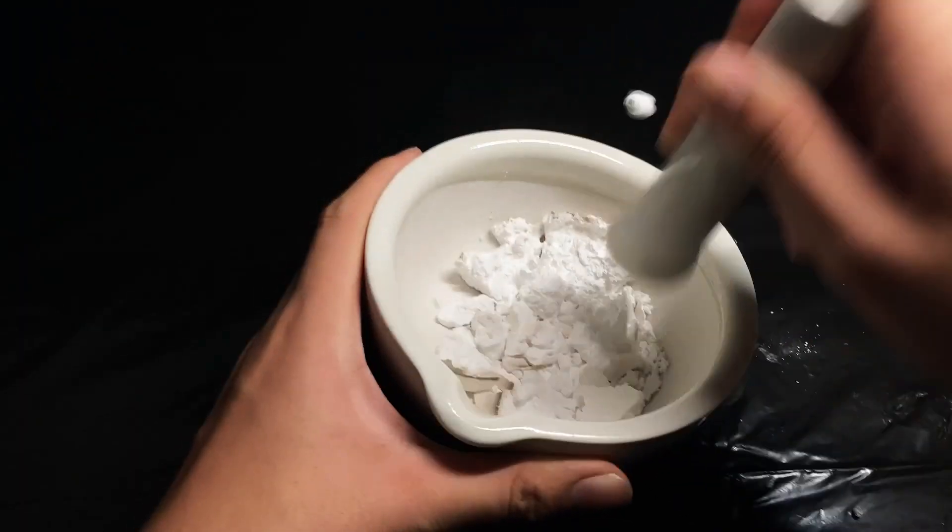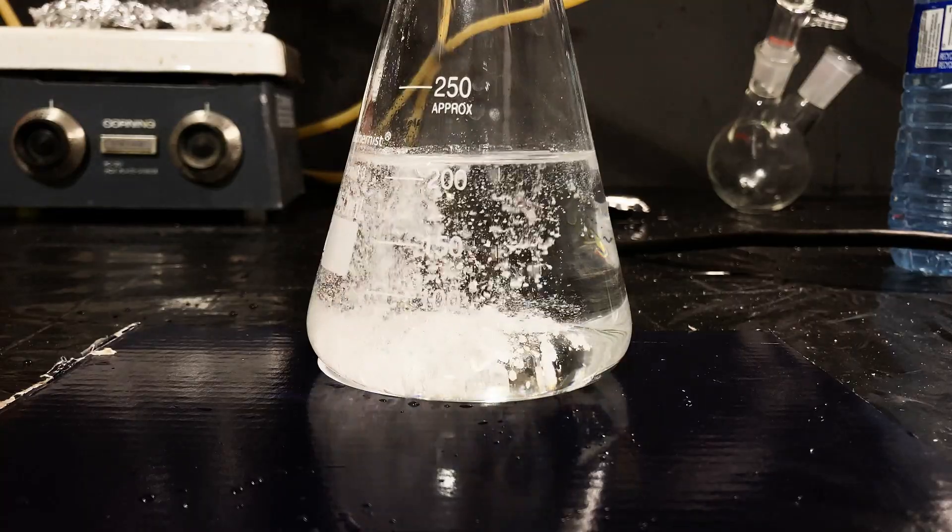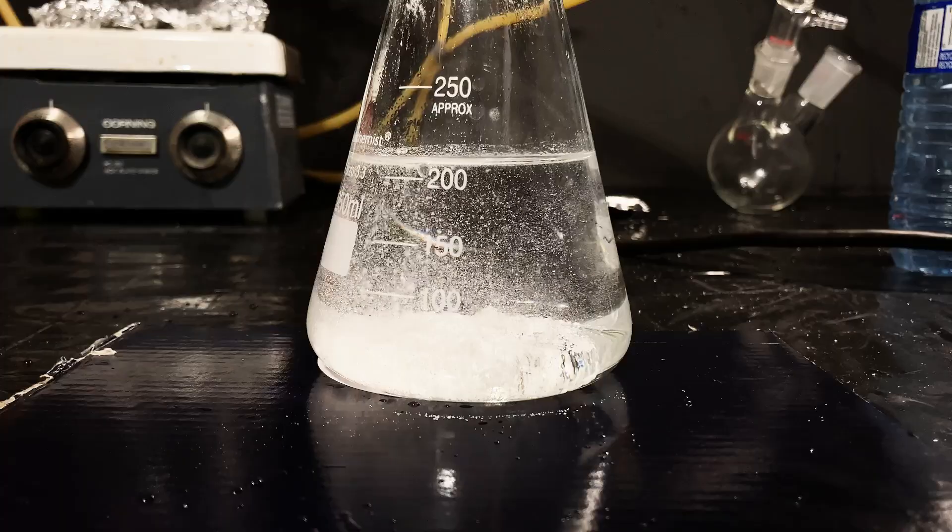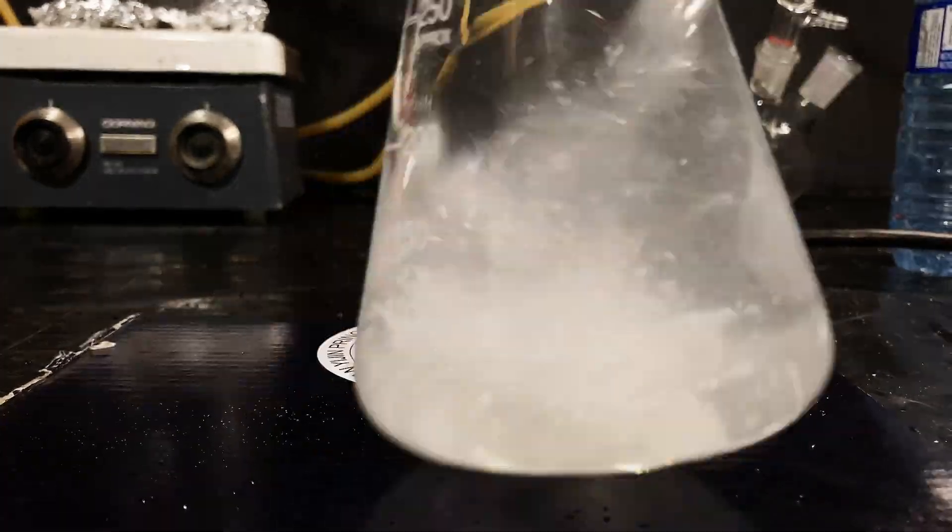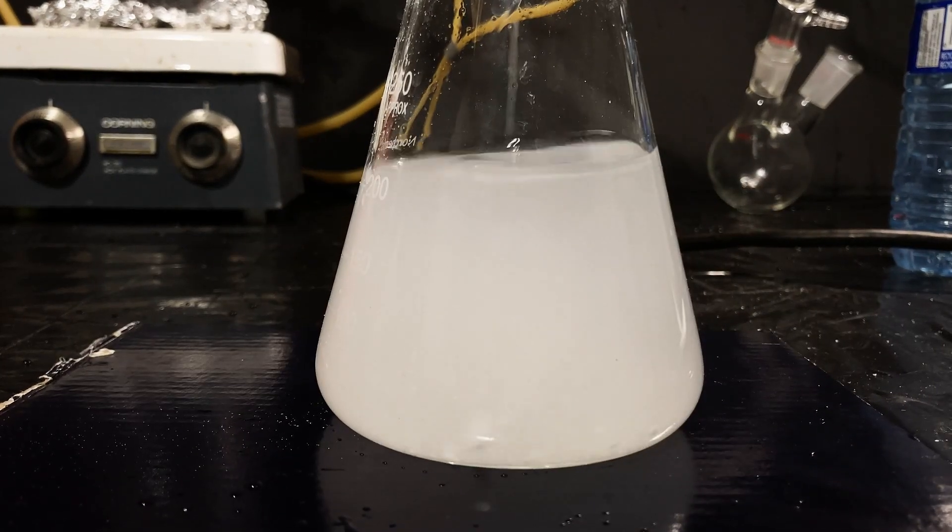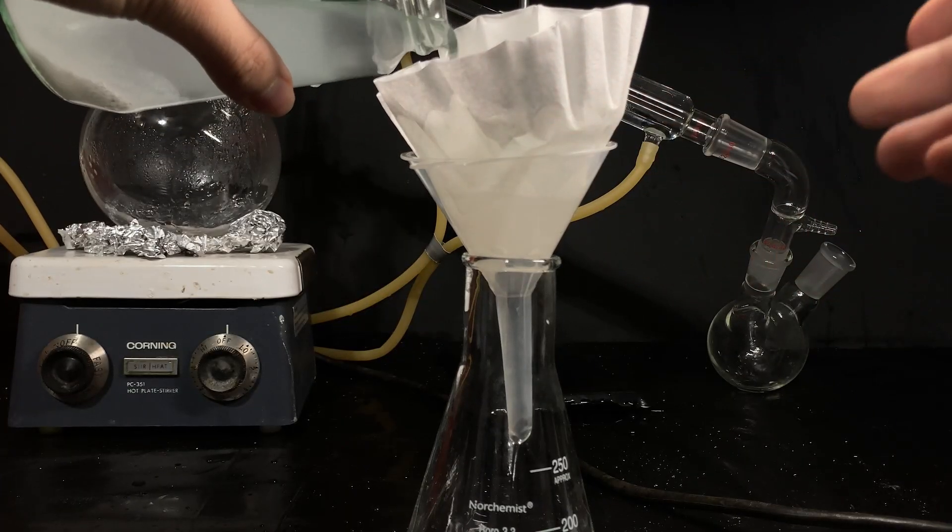Then, to dry it off, I dumped into the solution a drying agent called anhydrous magnesium sulfate that I made in an earlier video. This soaked up all the water that was present in the azeotrope. And just a quick tip, I can tell when I've added enough of the salt if I swirl it around and it forms a suspension, rather than clumping at the bottom. The salt can then be filtered off.